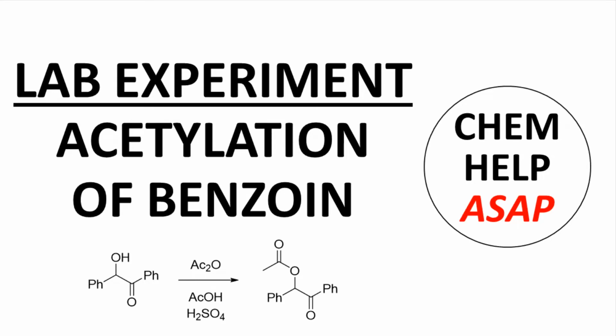In this video, we will show the acetylation of a molecule called benzoin. We will discuss the reaction, perform the experiment, isolate the crude product, and perform characterization of the isolated product. Handouts for the lab procedure and NMR spectra are available through links in the video description.